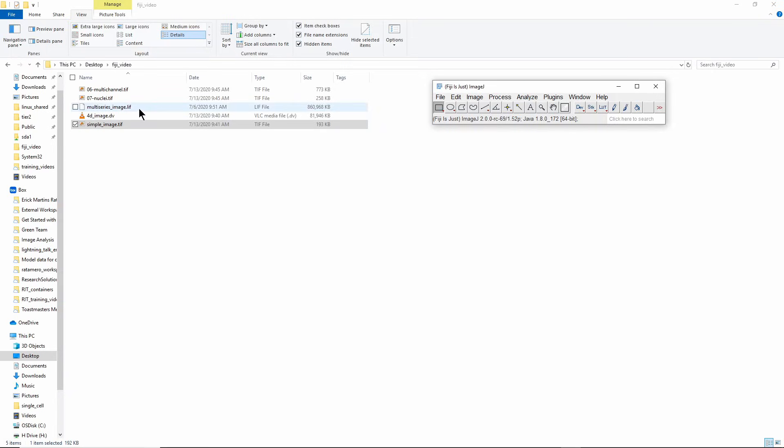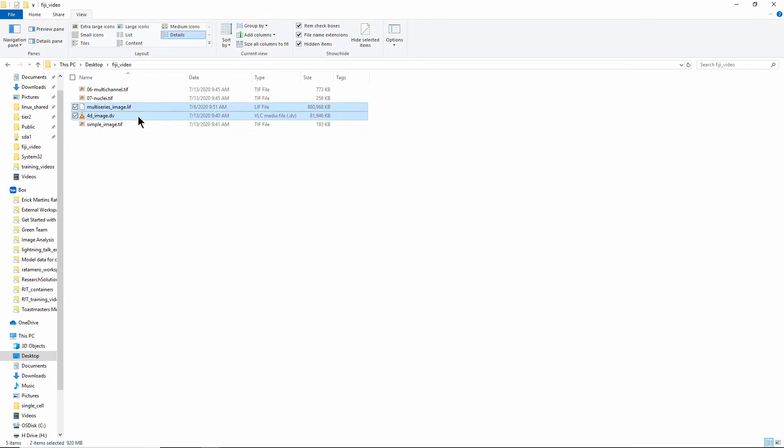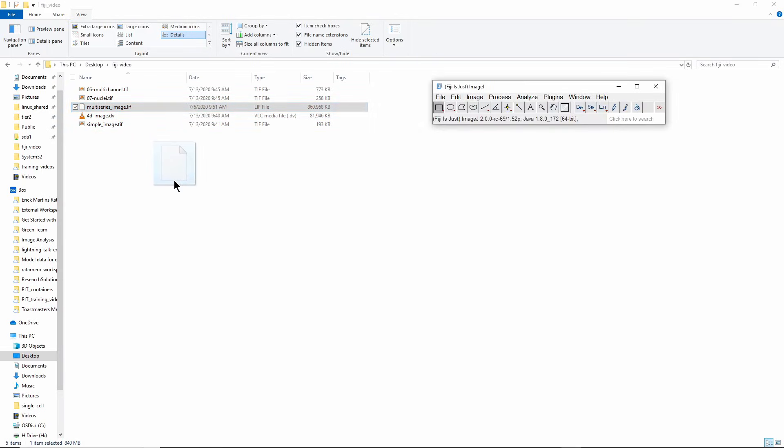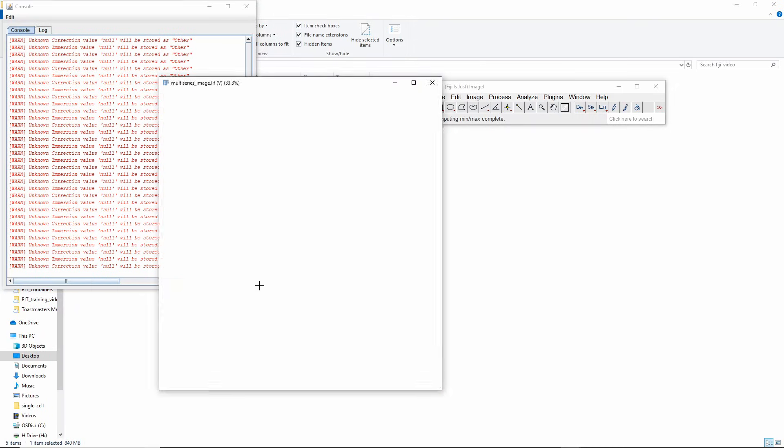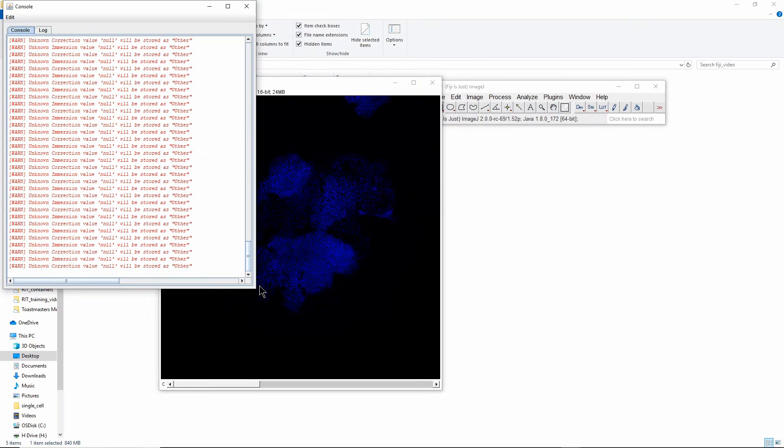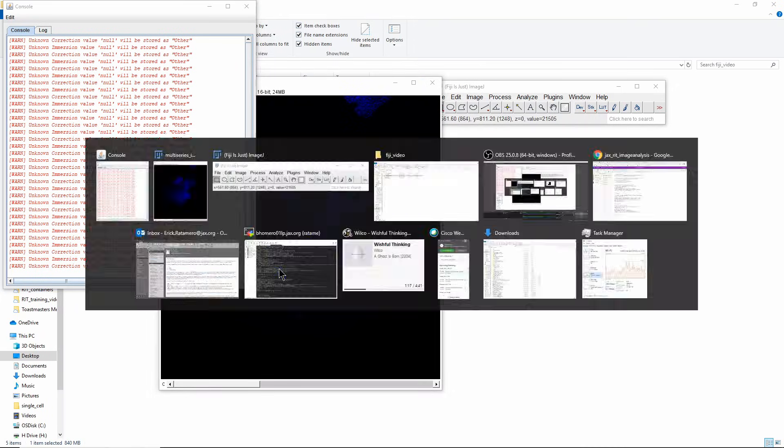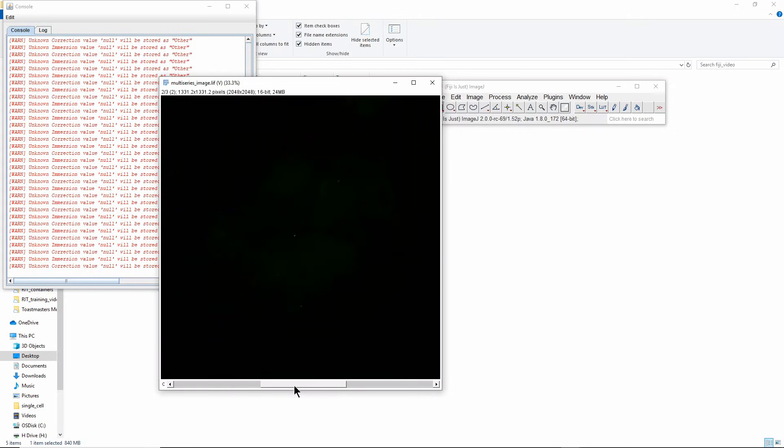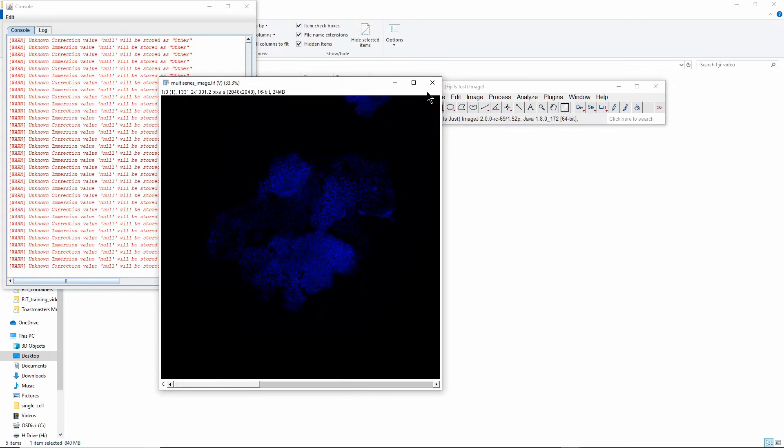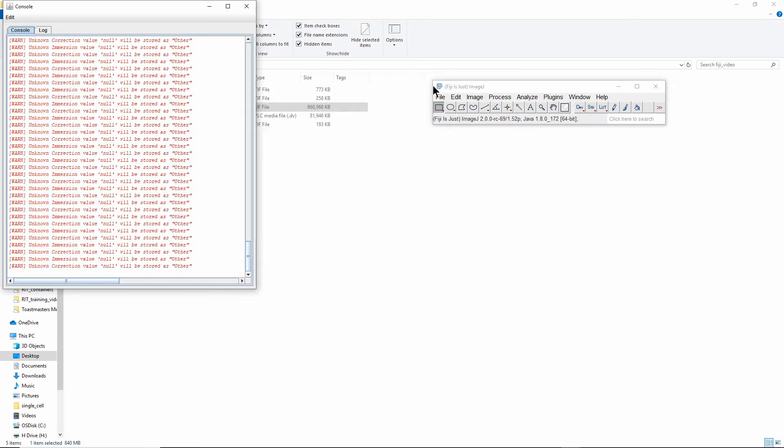Just as an example I'll try to drag this LIF image here into Fiji. You will see it will open, but it will open a single image. There it is. It will open one image with three channels, while in reality if you look at the file size here it's something like 860 megabytes. So of course that's not one single image.